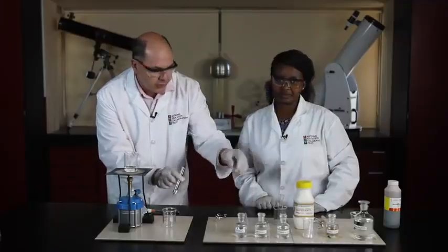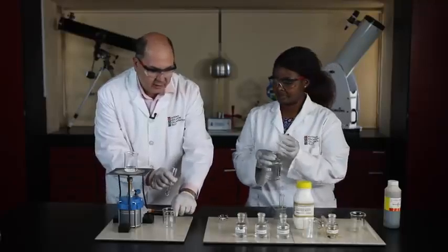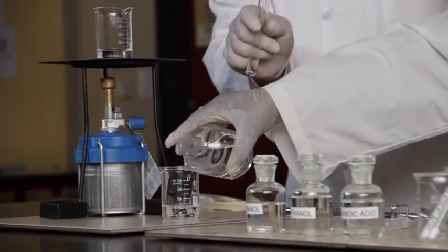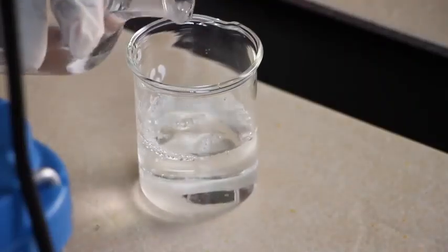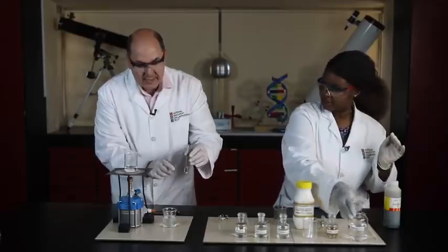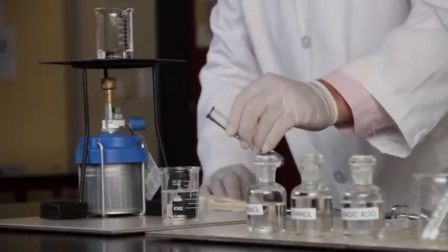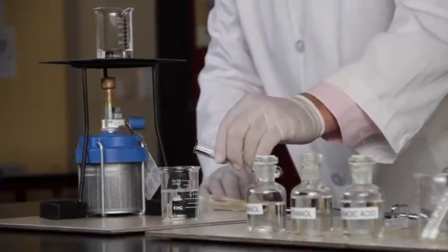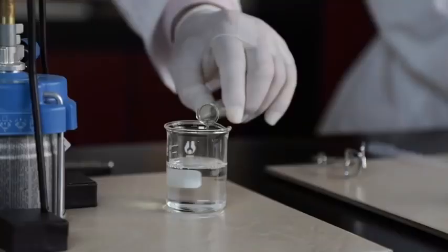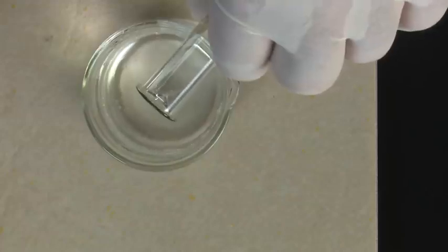So, Joyce, won't you bring some sodium carbonate from there? Let's put, yeah, there we go. Fill the beaker with sodium carbonate. Looking beautiful. And now we're going to get some reaction. Let's see what happens. Just slowly, slowly add the reaction mixture to the sodium carbonate. Look what's happening.